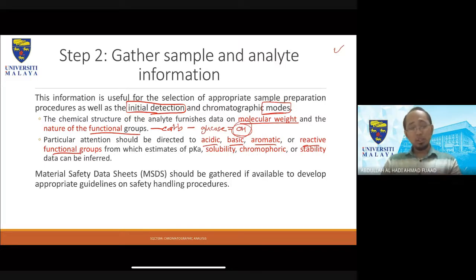Okay, it might still be good for a simple analysis, because the byproduct might be an indicator that your compound actually exists. But if you do that, then you cannot use an autocollector to actually purify your sample using HPLC. So give and take, right?